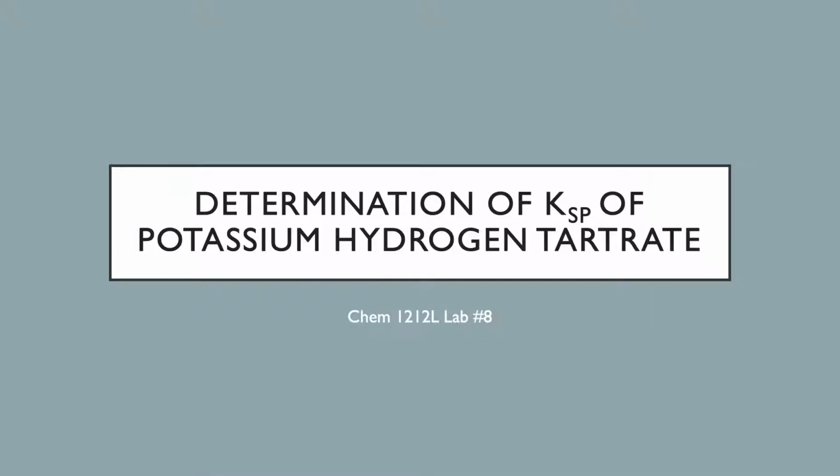All right, welcome to another week of the 1212 lab here at North Georgia. So what we're going to be taking a look at this week is the determination of KSP for potassium hydrogen tartrate, which is just an ionic compound.